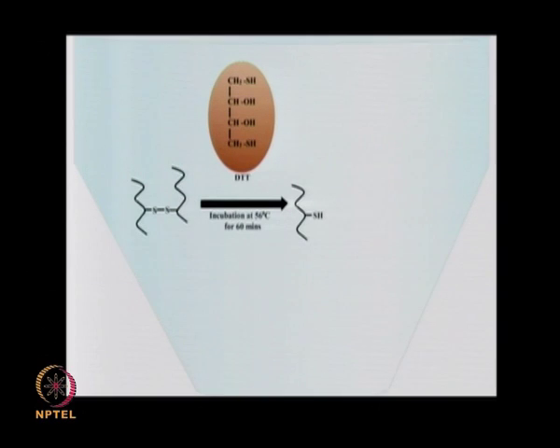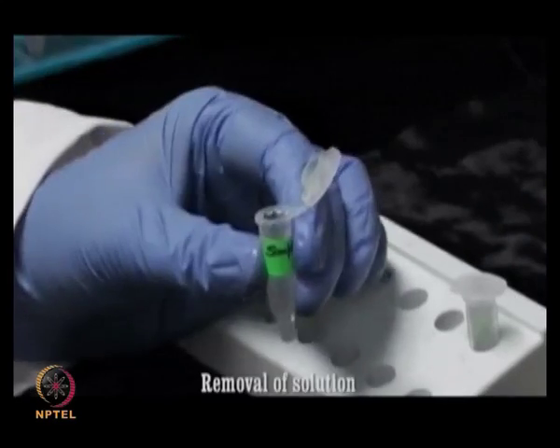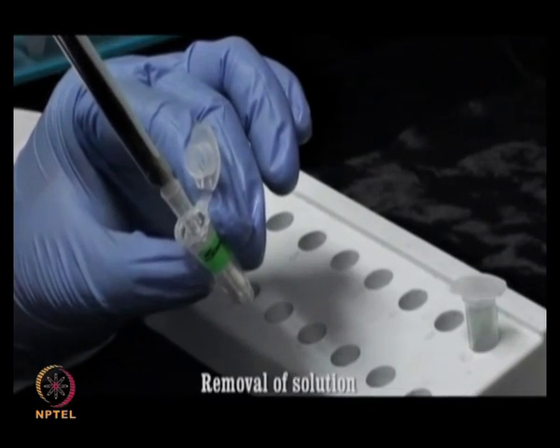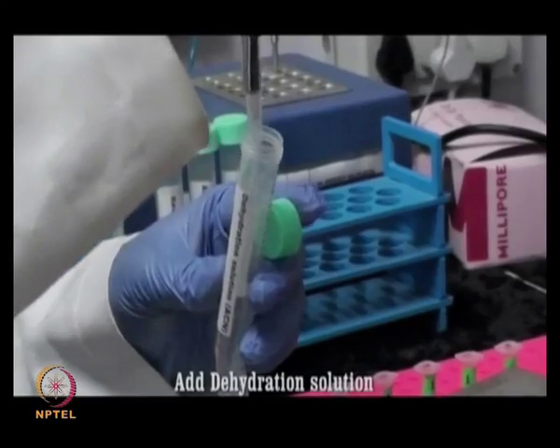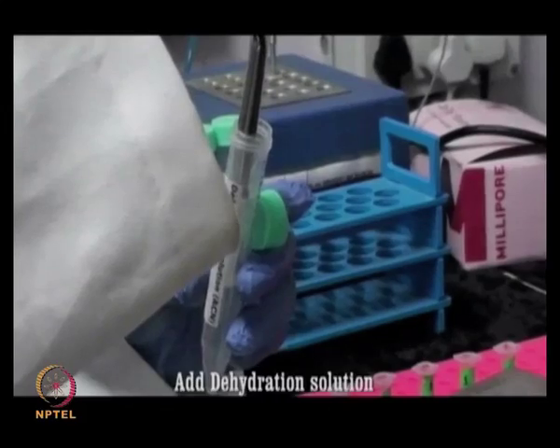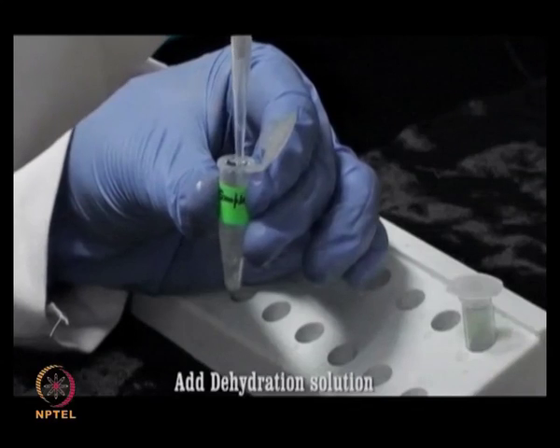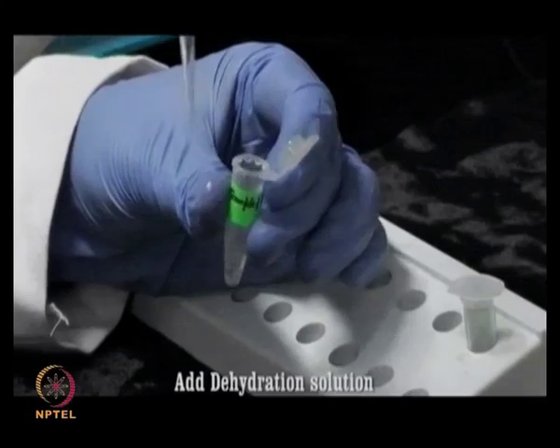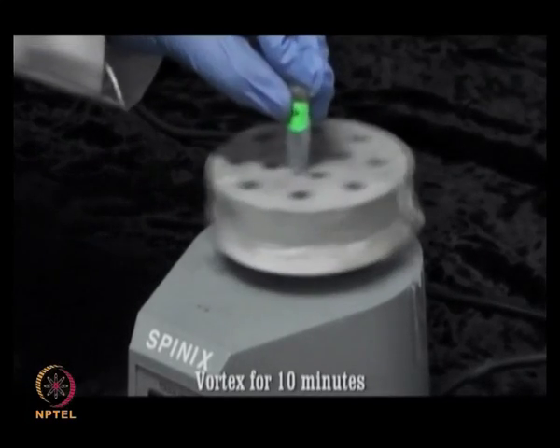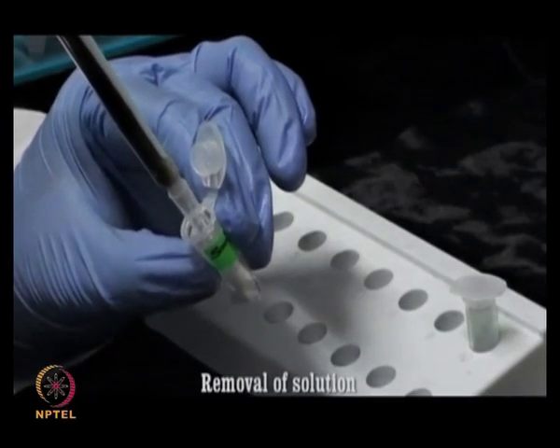Now, treatment of protein residues with dithiothreitol breaks the disulfide bonds. Now, chill down the tubes to room temperature, add 50 microliter of dehydration solution, mix it properly and incubate for 10 minutes. Now, remove all the liquids.